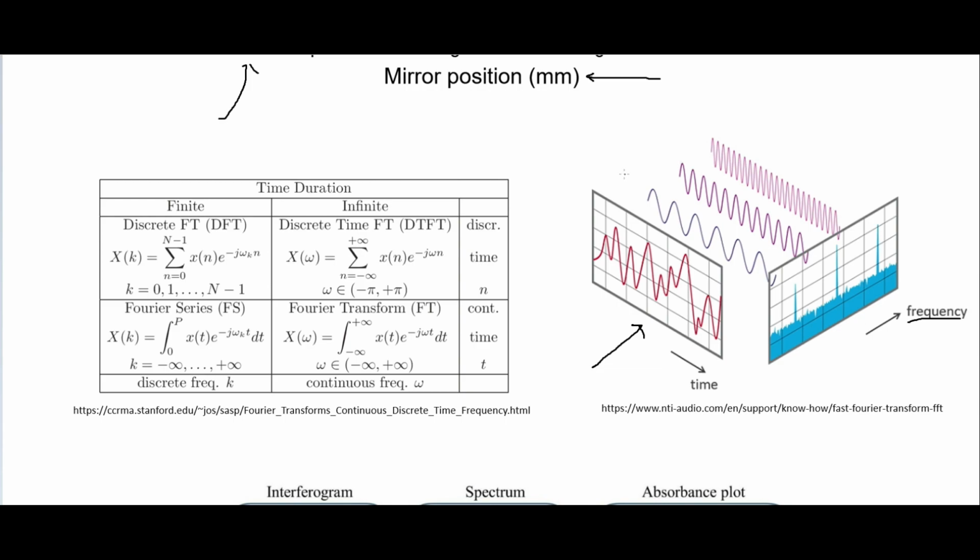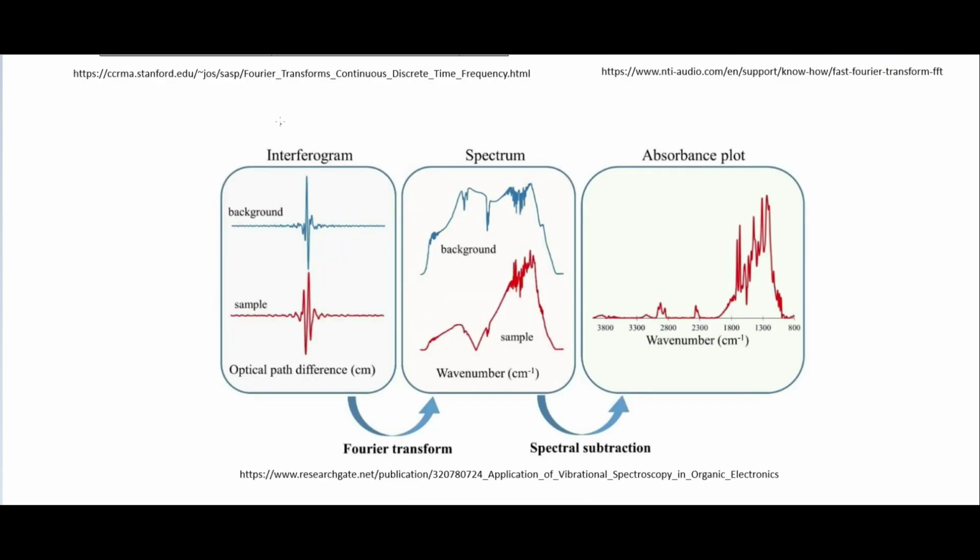And so we can sort of disambiguate all of these wavelengths here, and so that will tell us at what frequencies this is absorbing, because if it's, say, absorbing this frequency but not this one and not this one, then when we do this Fourier transform, we will find that, say, this peak would actually go away, even though, because we know what light we're putting out, we would expect one there, and so we would know that it's absorbing at that wavelength.